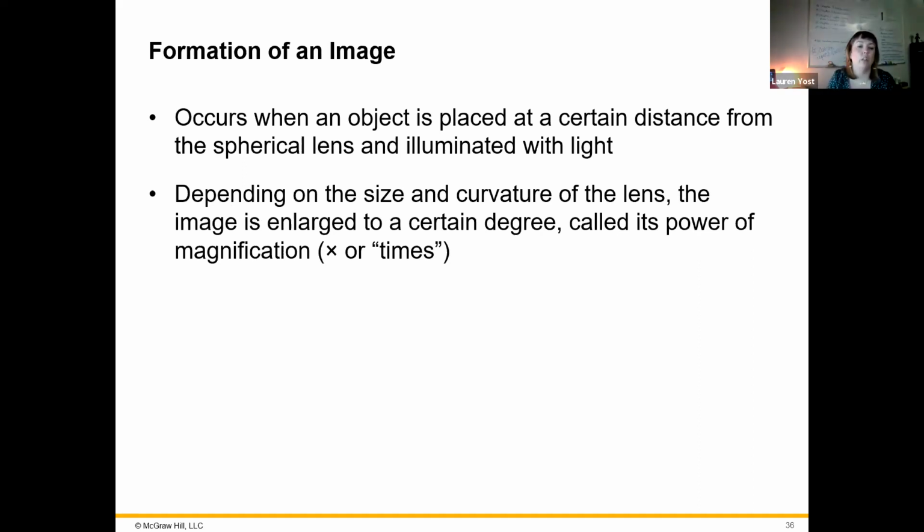Essentially, whenever we are looking through a microscope, what we're seeing is the virtual image. So the real image is what's seen by the lens that's picking up the image from the specimen itself. That is called the objective lens. And then it goes through some mirrors and stuff, and then through another lens, the ocular lens, that creates the virtual image that magnifies it just a little bit more. And then that's what we see. So that's what's really going on in the microscope.